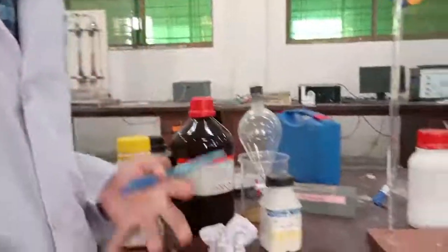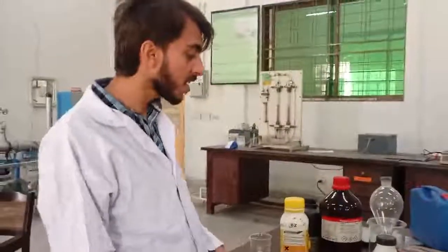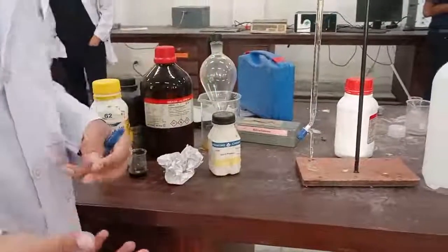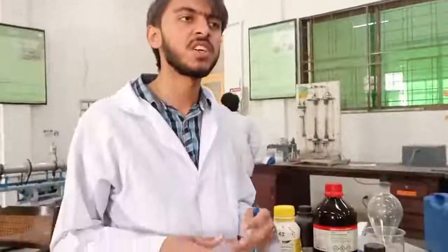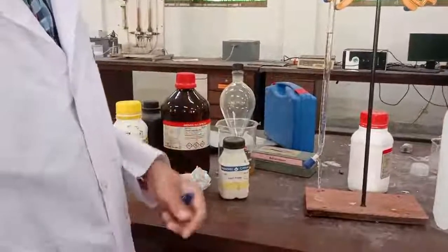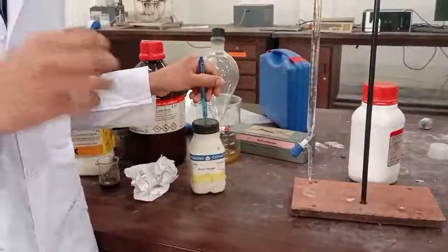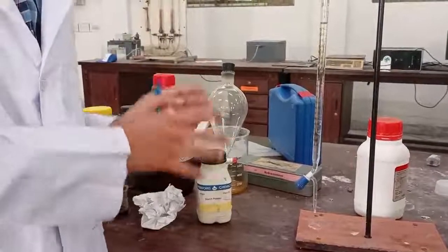When it becomes totally mixed, we add water to make it up to 1000 ml. After that, we take starch and again take 100 ml of water and mix 10 grams of starch in it. We heat the water so the starch can easily dissolve in it. When the starch is totally dissolved in the water, we will get the required starch solution.